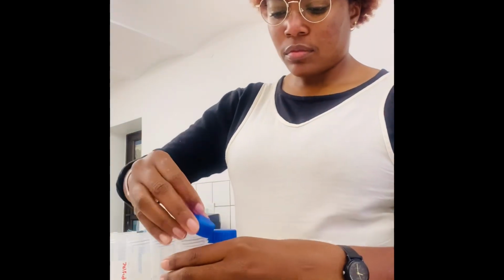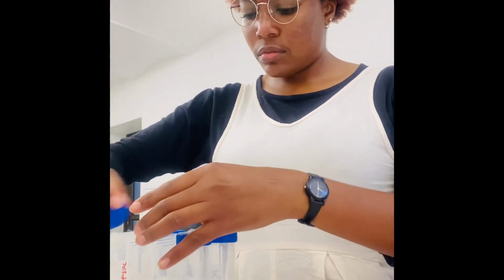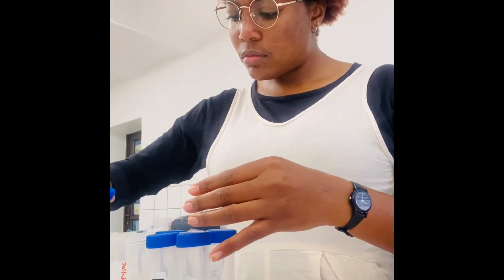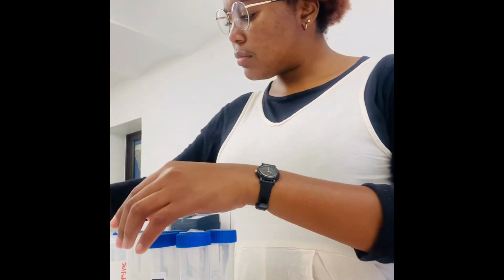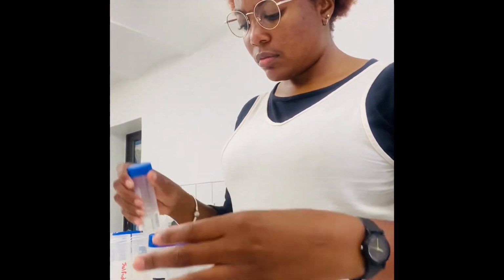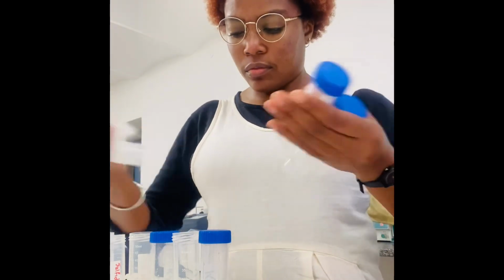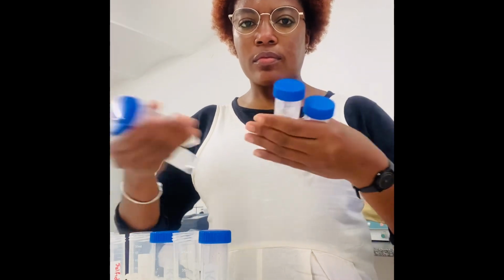There are 4 types of nutrients that I analyze: nitrate, phosphorus, sulfide, and silica. They all play a very important role in the water, basically for the marine organisms, and so they are needed, just like how we have our vitamins, vitamin B, vitamin A, and all those.